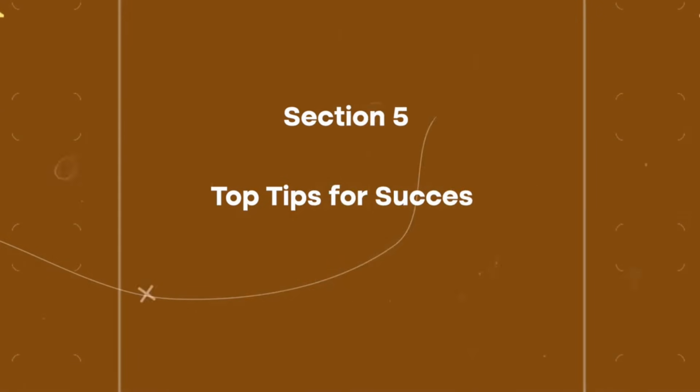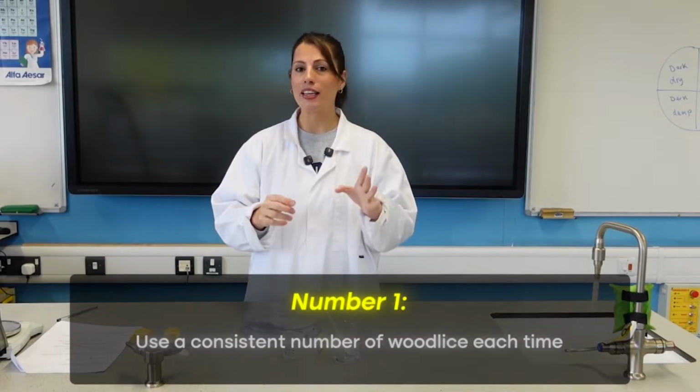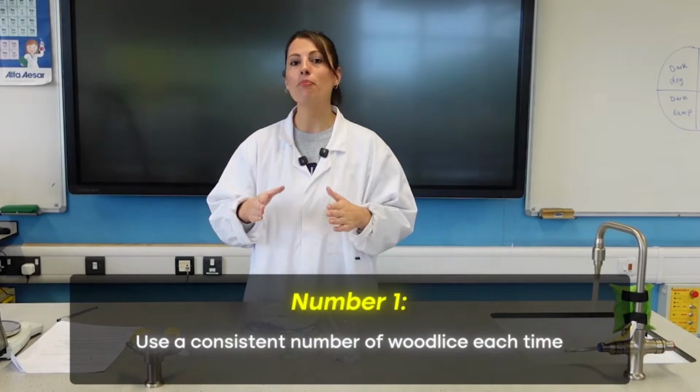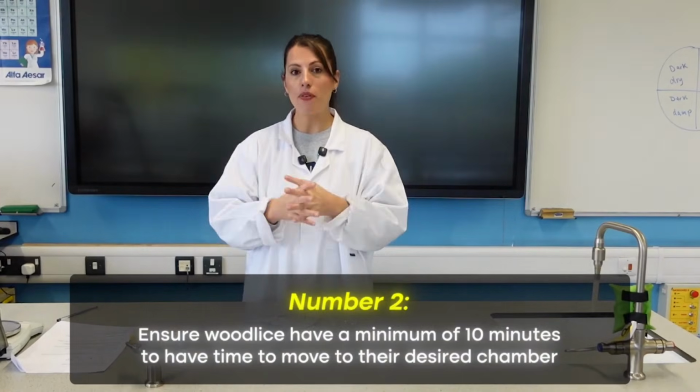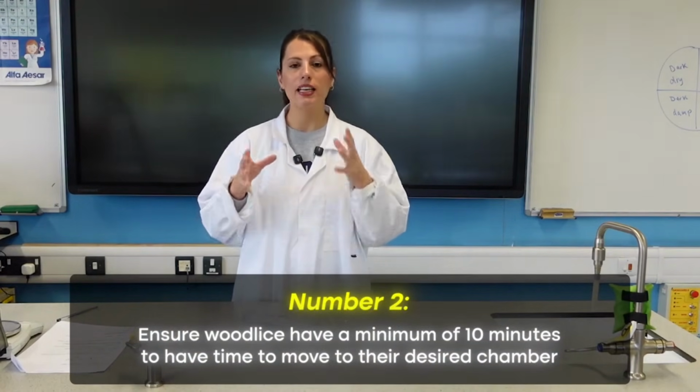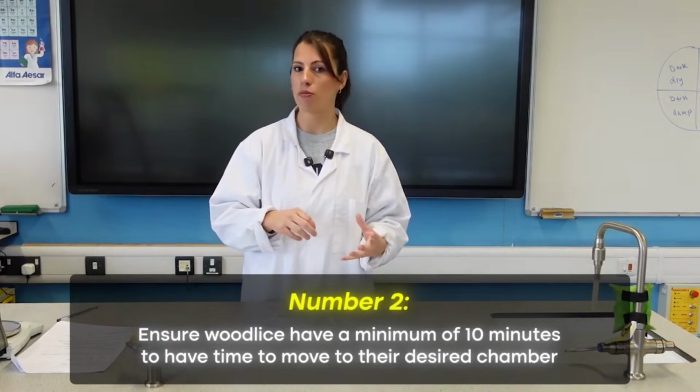So finally, some top tips for success that you could share with your students. Number 1 is making sure they are using a consistent number of woodlice every single time. Number 2, make sure that they do have a minimum of 10 minutes in the choice chamber, because then that gives them 5 minutes to acclimatise, 5 minutes to move around.